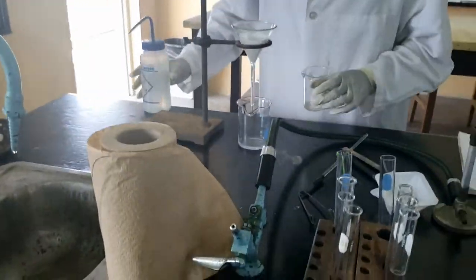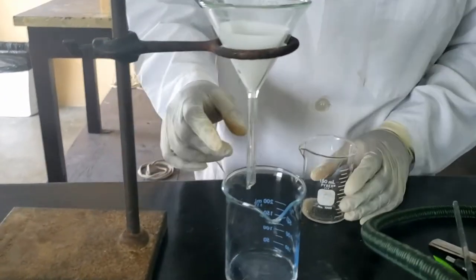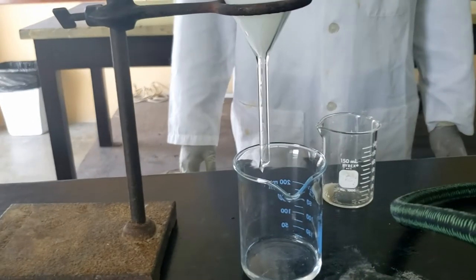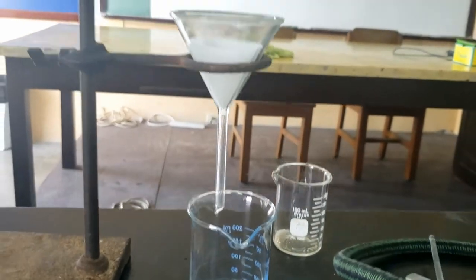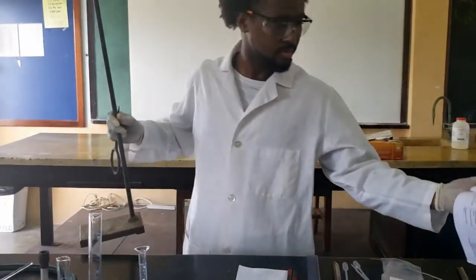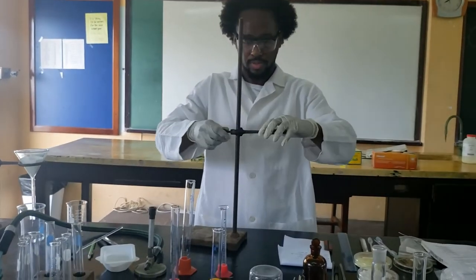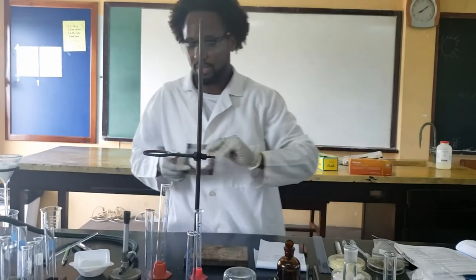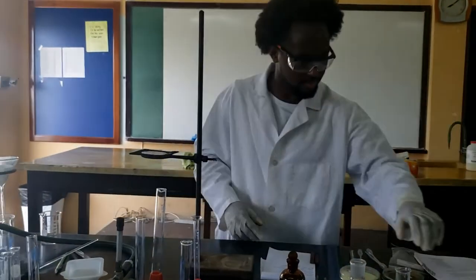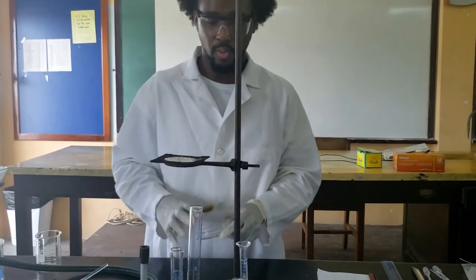Checking back on the salt and sand mixture — it is pretty much almost finished filtering, and we should have enough liquid to do the second part of that experiment. What I am now preparing for is for us to evaporate that salt and sand mixture filtrate.